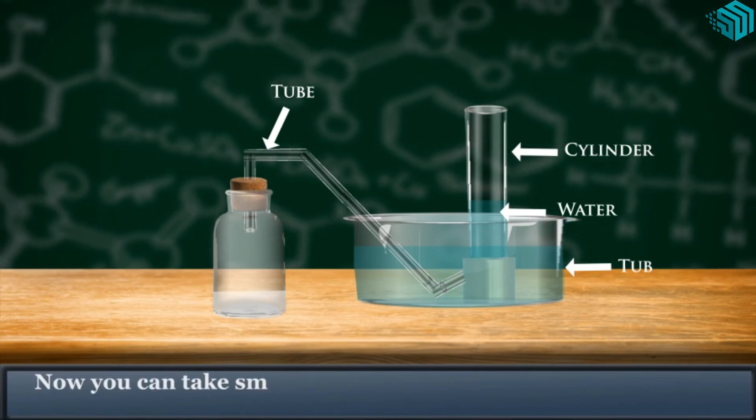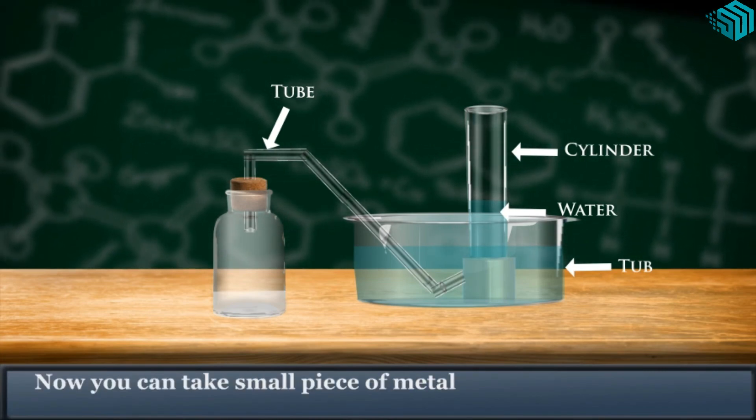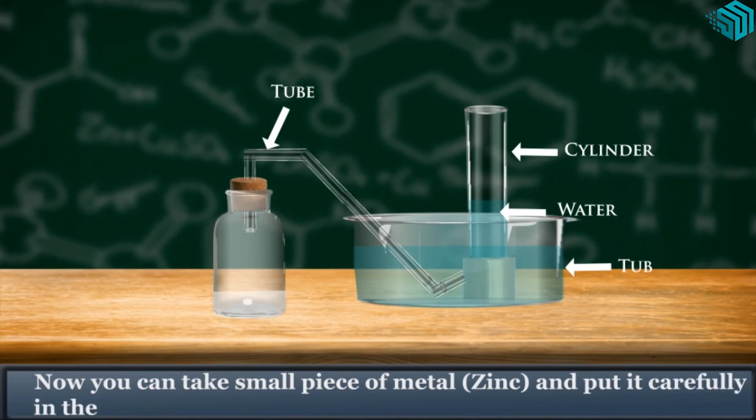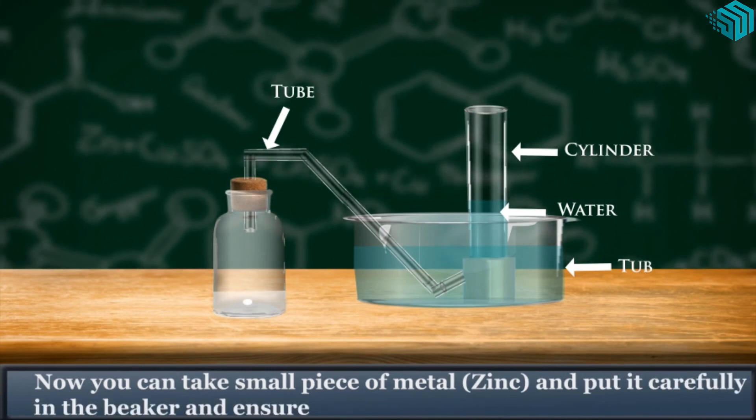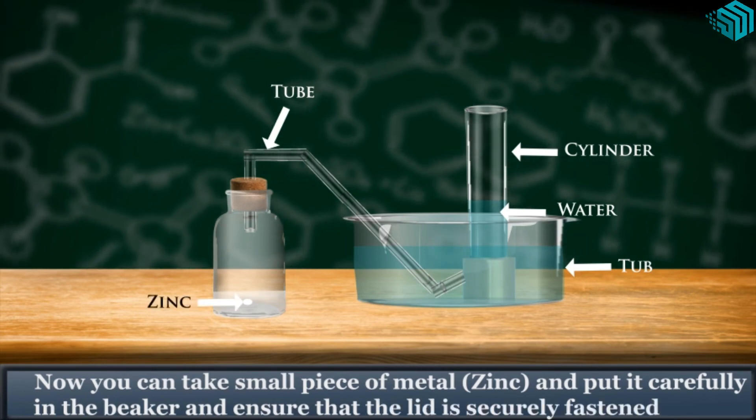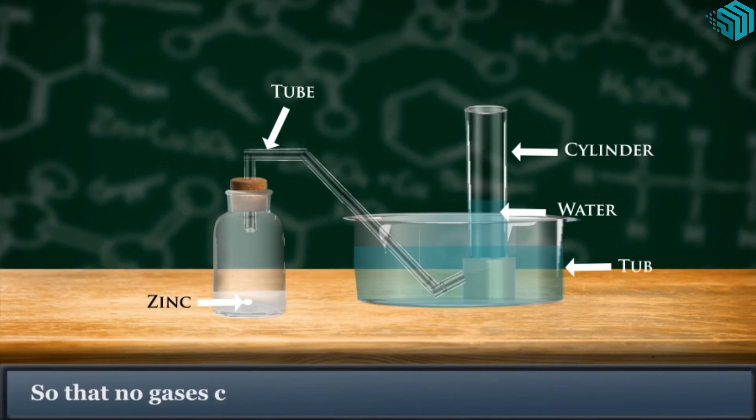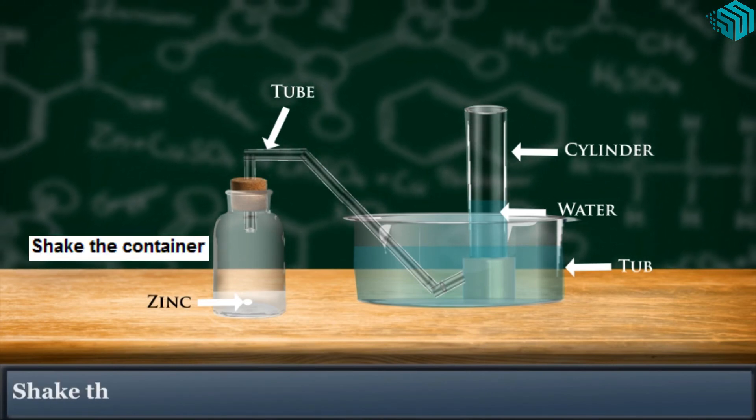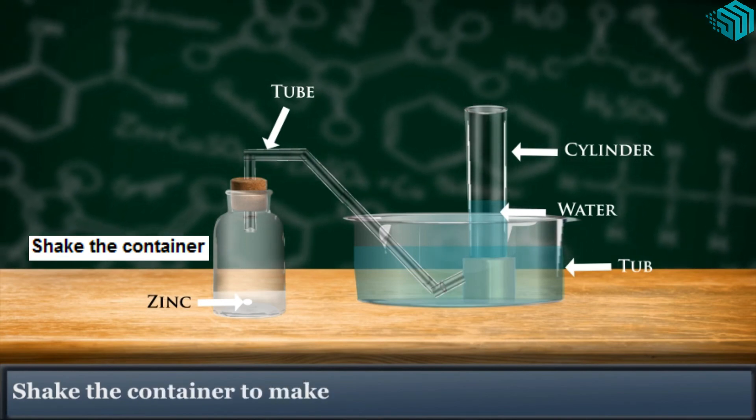Now you can take a small piece of metal, which would be zinc, and put it carefully in the beaker and ensure that the lid is securely fastened so that no gases can escape. Shake the container to make the reaction take place more quickly.